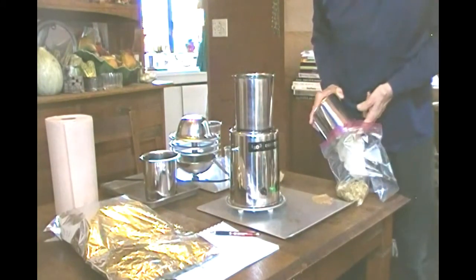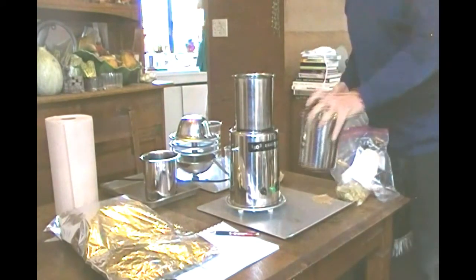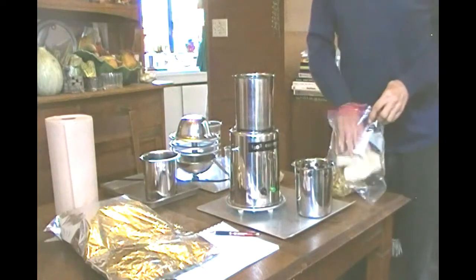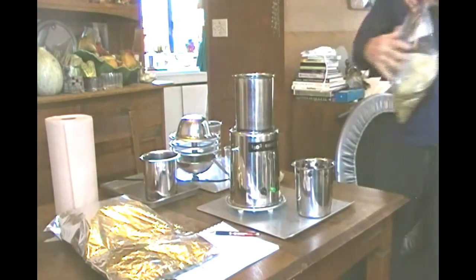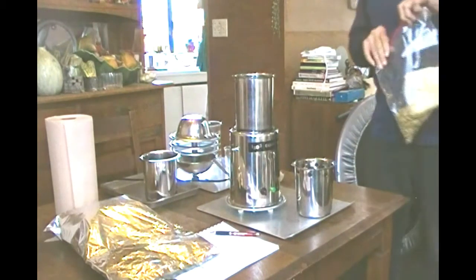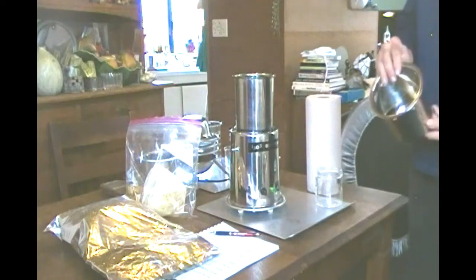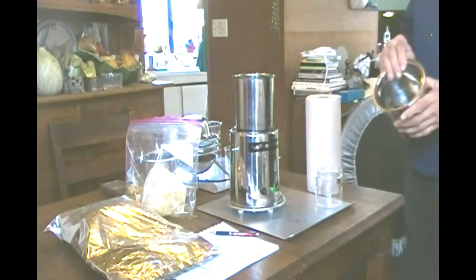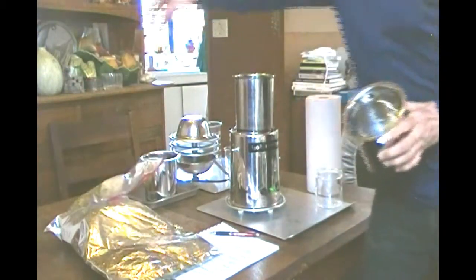Take the filter paper out also. Seal this up because we're going to collect most all the alcohol that's in this later. We've wiped down the collection vessel, the extraction basket, and we've saved the wet extracted hops flowers.